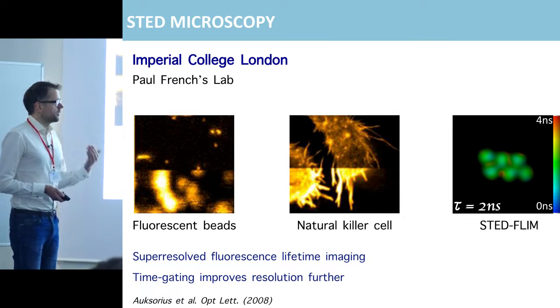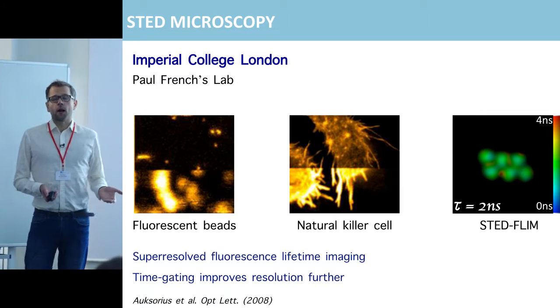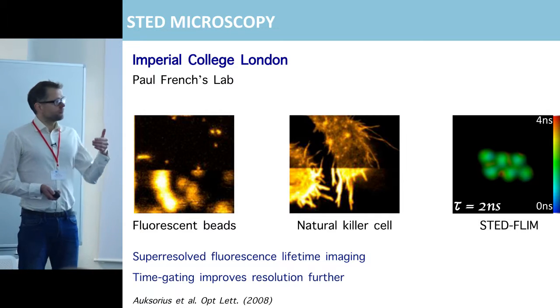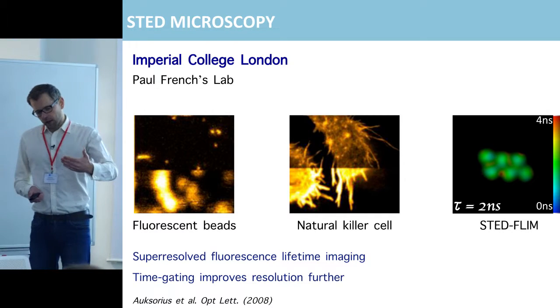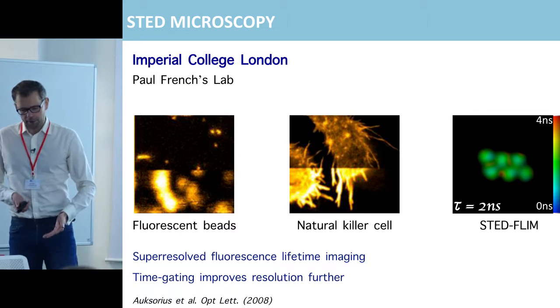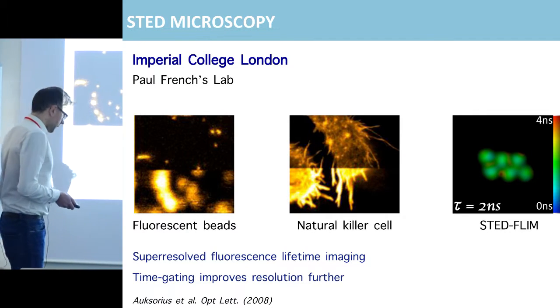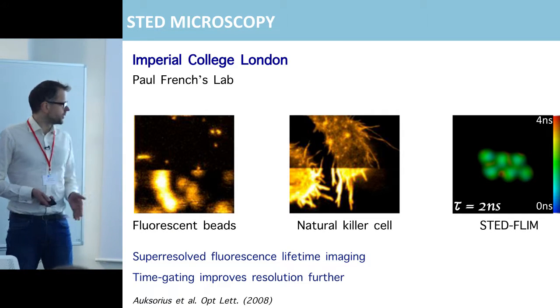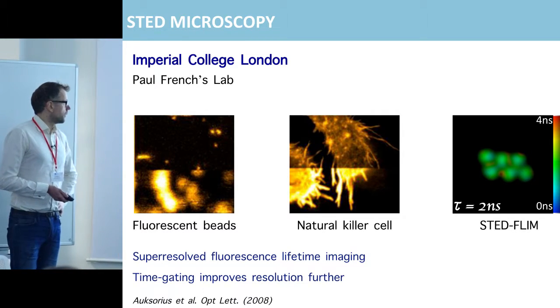So we demonstrated that FLIM can be combined with STED, and also at that time we demonstrated that by rejecting early arriving photons we could improve STED resolution even further. In fact, even some commercial microscopes utilize that principle nowadays.